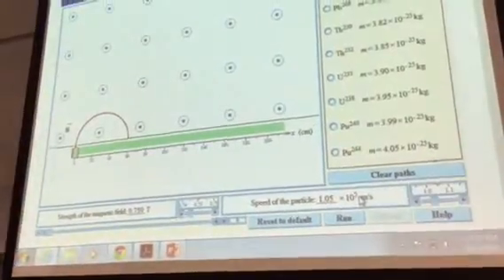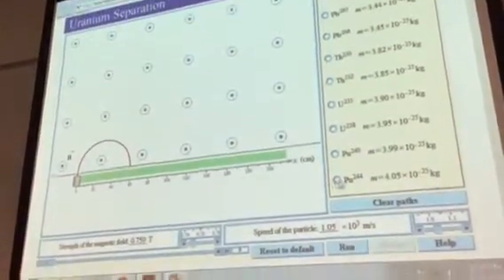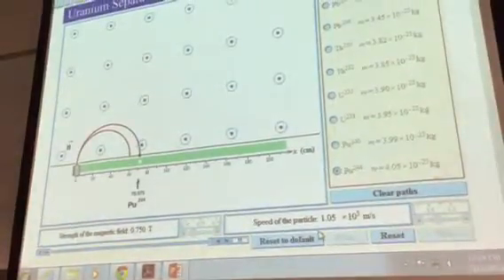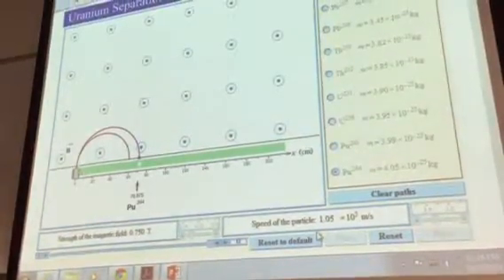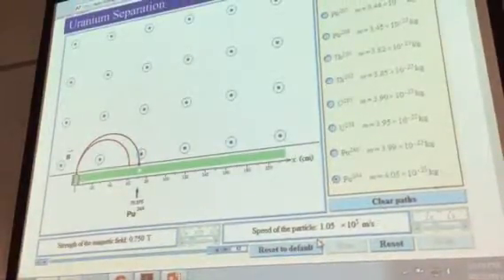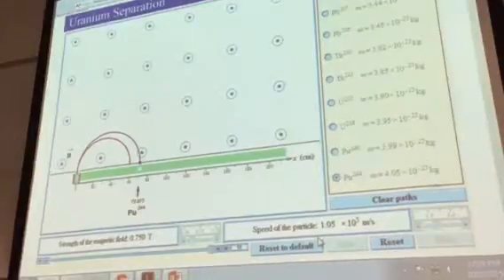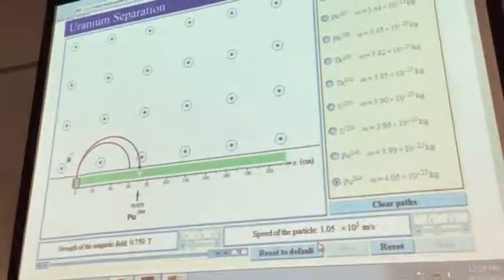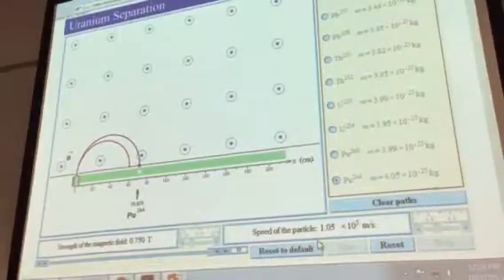Apex, I guess, of the path. So we'll pick the heaviest isotope and run that one in the same parameters, and there's what you see. I think that's consistent with what you were predicting, Ms. Mitchell, if I heard you correctly. And maybe, I'm not sure exactly about the water analogy. Didn't follow that exactly, but the outcome of your analogy, I dig, and we see it here.